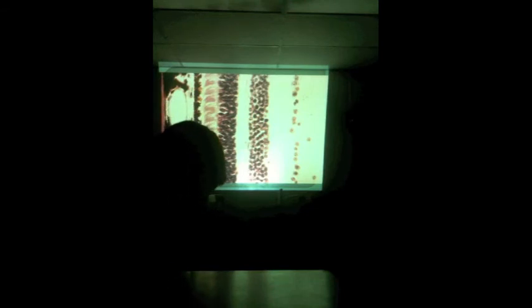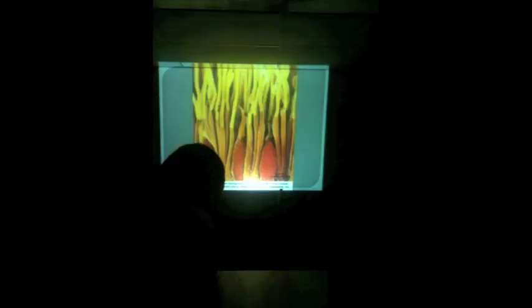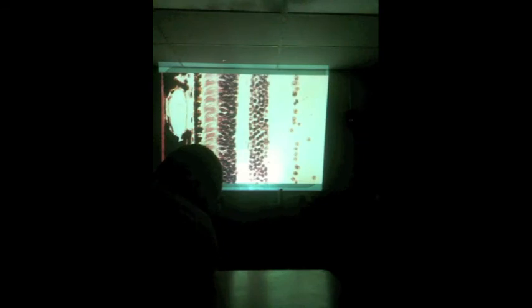I have a question. Yeah. What did you say was before the pigment layer? So this pigment layer for the retina, okay, the layer before it is going to be the functional units of the rods and cones, the actual rod or cone-shaped part. If you remember that EM that has a rod and a cone laying out on it, one is kind of cone-shaped and one is rod-shaped. They're going to be here, and then their cell bodies are going to be this dark outer nuclear layer. All right? Okay. Good.